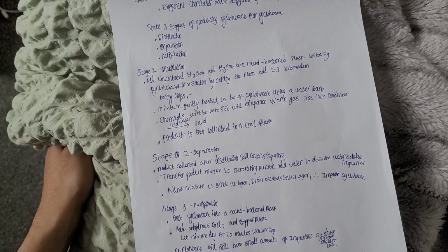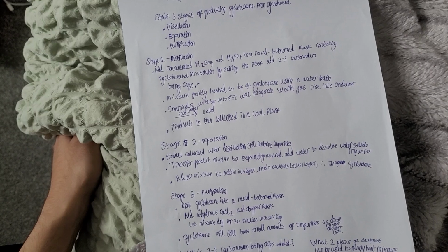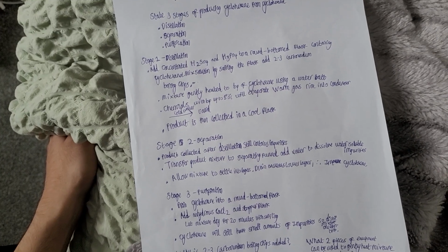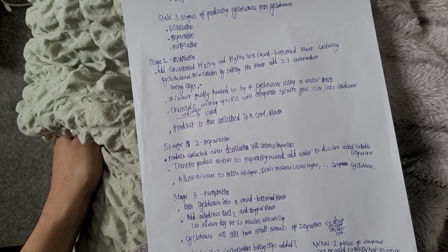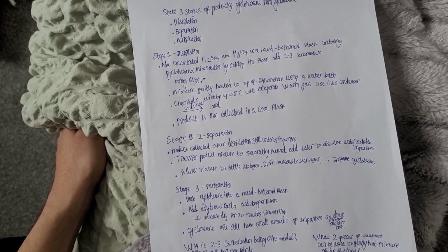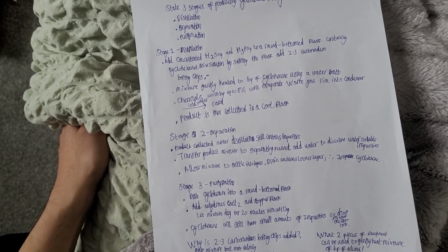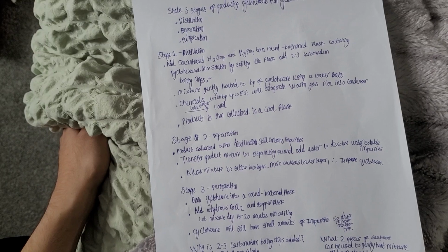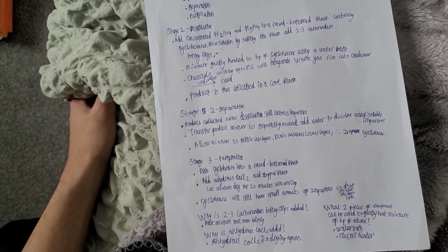So stage 1 distillation, we want to add concentrated H2SO4 and H3PO4 to a round bottom flask containing cyclohexanol. Once we've added them, we want to mix the solution. How do we mix the solution? By swirling the flask and adding 2 to 3 carborundum boiling chips. Then the mixture is gently heated to the boiling point of cyclohexene using a water bath, or we can use an electric heater. Chemicals with boiling points up to 83 degrees Celsius, the boiling point of cyclohexene, will evaporate, and a warm gas will rise into the condenser, and we use cold water to convert it into a liquid. The product is then collected in a cooled flask.